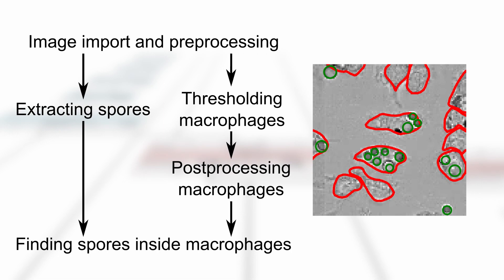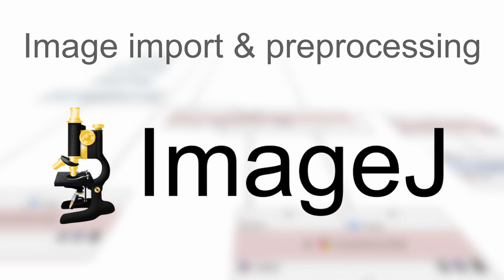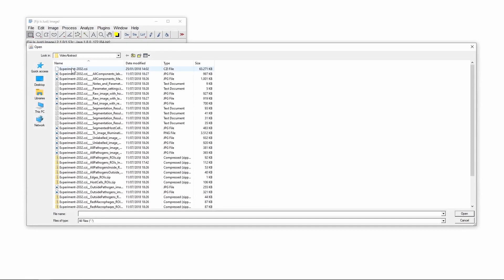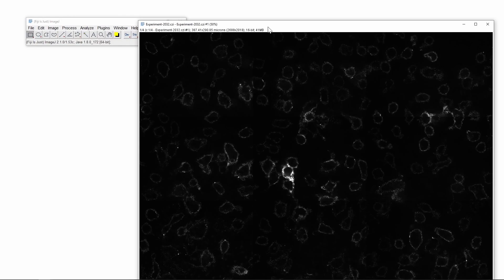Now, we will start with importing the image into ImageJ. We will use the File Open command to find the image and then to load it into ImageJ. Here we loaded a native format confocal microscopy image, which contains four channels.